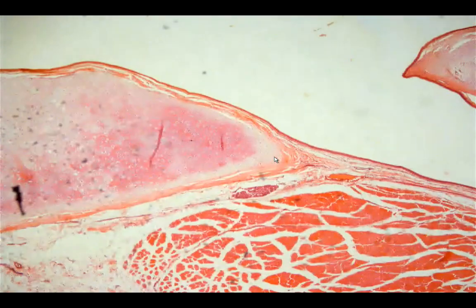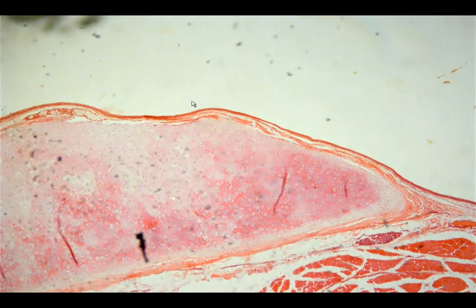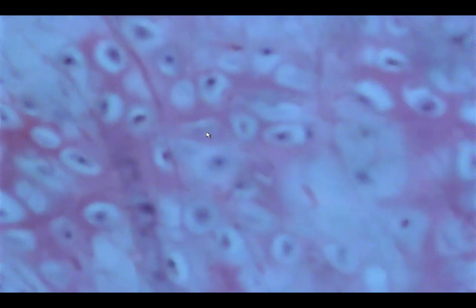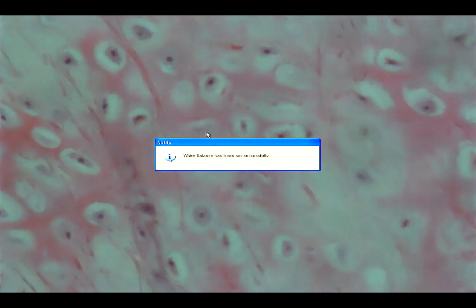Moving to the false vocal cord, there is simply a recess over this portion, and another cartilage is present. What type of cartilage is this? You can see the presence of fibers, so this would be elastic cartilage.